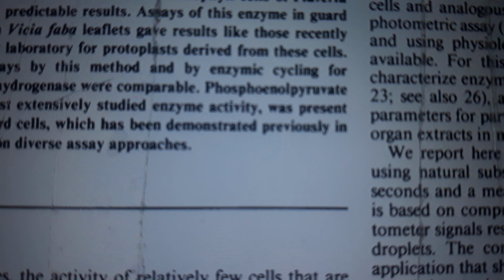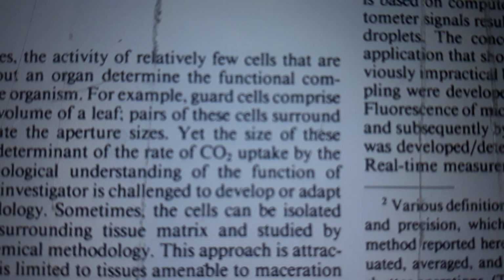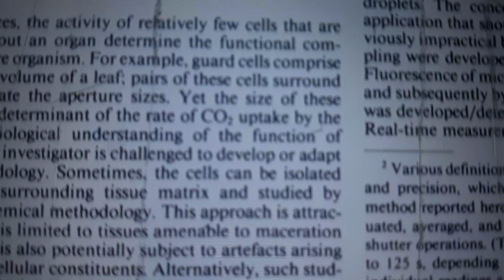A product accumulated during a long incubation is measured later, or they lack sufficient sensitivity for high time resolution. Thus, a method suitable for single cells and analogous to a conventional NADP-linked spectrophotometric assay, that is, automated, real-time, direct, quantitative, and using physiological substrates in solution, has not been available. For this reason, there have been few attempts to characterize enzyme activities kinetically in single cells, and almost all validations of assay parameters for particular cells have been conducted using whole organ extracts in ml volumes.